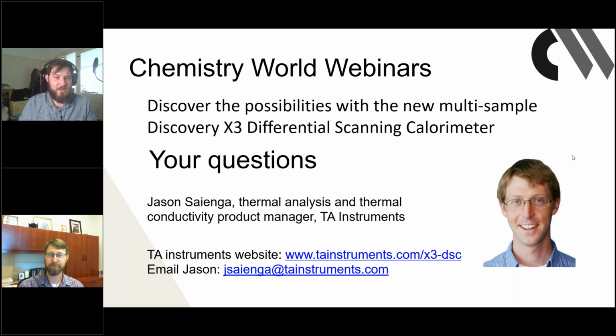You talked about auto calibration, so we've had a question from Seha who says, how easy is calibration of the equipment compared to the older generation? Yeah, again, because you're only setting up one experiment, or one test, to collect information on 3 samples, the calibration is virtually identical to what you would utilize in a Discovery, even in a Q series before that, if you're used to that generation.